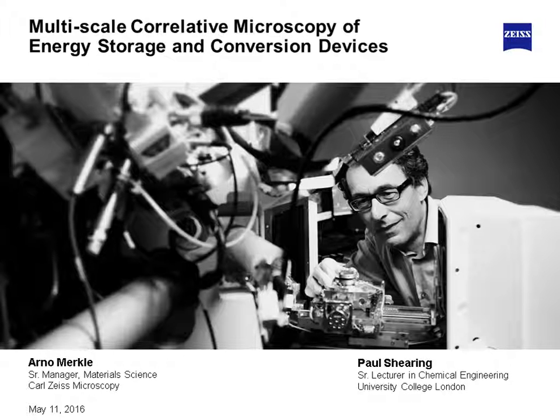Yeah, if I can jump in there real quick, Paul, to summarize that, and also come back to that initial question, which I actually diverted from briefly, on the analysis side, for example, how you calculate porosity. Obviously you first have to start with segmentation, but the examples shown in the slides today typically come from software after the reconstruction step, after it's segmented and then quantified in some manner.